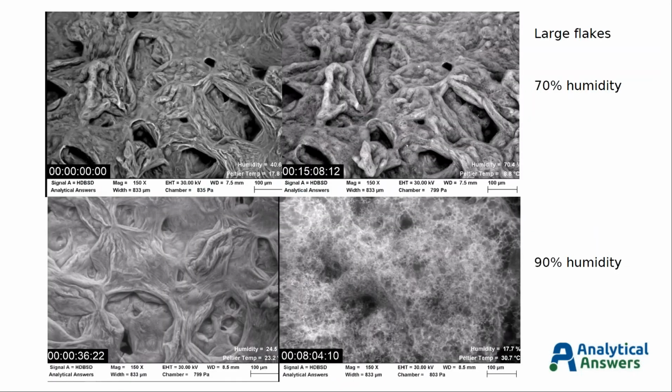So if we go back to our slides, again, this is just some comparison stills. And if you look at the top two images, the top left we have the large flake at 70% with initial time, and then after 15 minutes at 70%, you can see a noticeable difference between the start and the end image, but you couldn't actually follow that very clearly in the video, because between each second of video there was very little difference going one to the next.